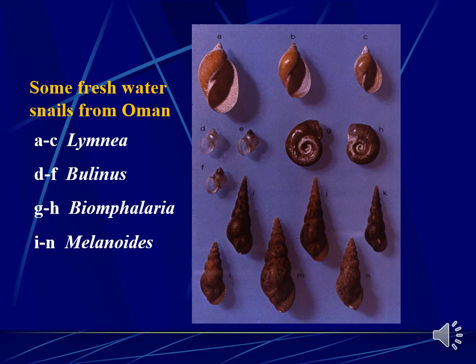The other two to your right, that is G and H, are Biomphalaria snails. They were named Biomphalaria arabica at the beginning, but genetic studies show that they are typical Biomphalaria pfeifferi, which are very common along the Rift Valley in Africa. So possibly these snails used to be the same species before the continental drift, so that's why it may be coming from Africa.